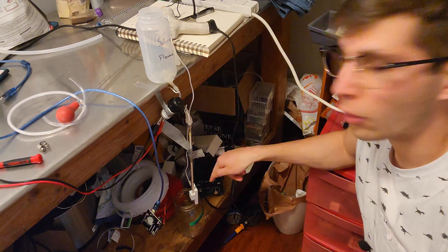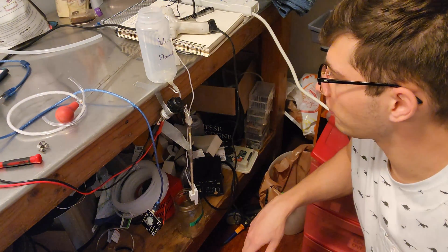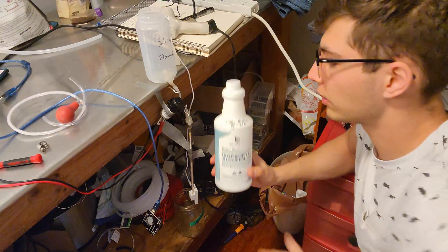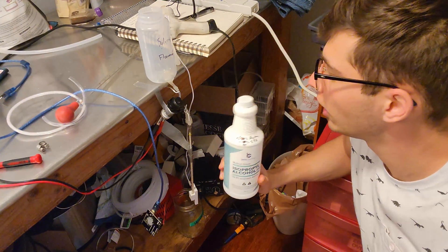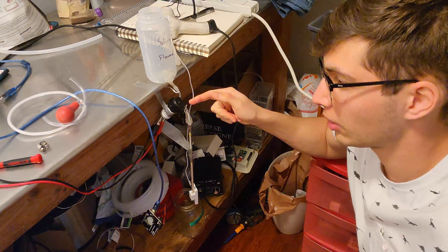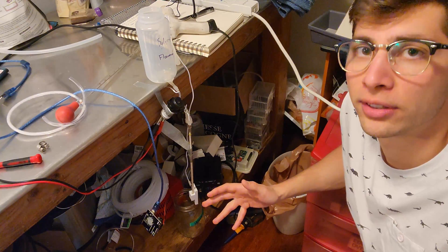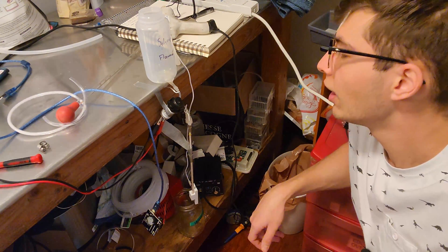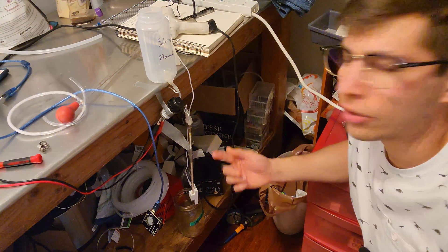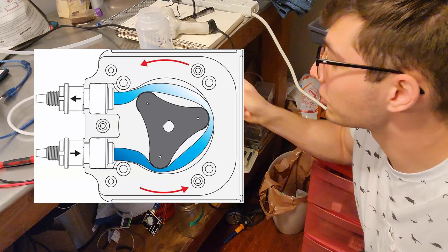Believe it or not, this is the whole LPLC system. It's not pretty, but it's surprising what you can do with just a little bit of kit. Starting at the top, we have a solvent reservoir that I'll fill with the 95% isopropyl alcohol and 5% acetone solution. A tube runs down to a peristaltic pump running at 3.7 volts, drawing almost 200 milliamps. Peristaltic pumps are really interesting — none of the moving components actually touch the solvent being pumped, so the solvent won't melt any internal plastic pieces. They're also relatively cheap, about $10, with little rollers that massage the fluid through the tube.